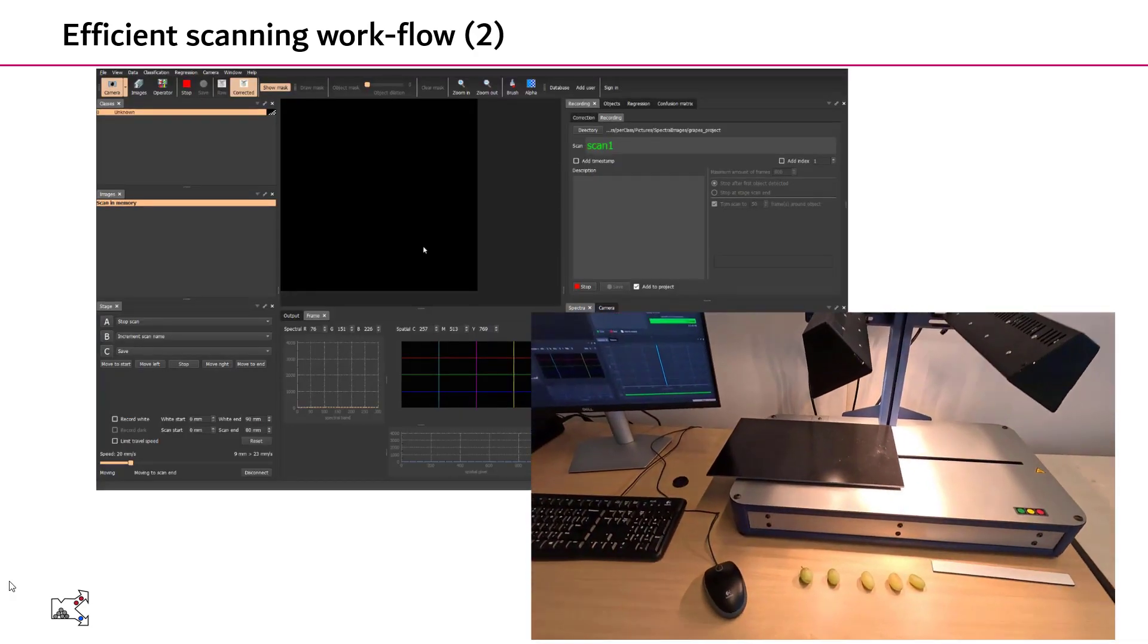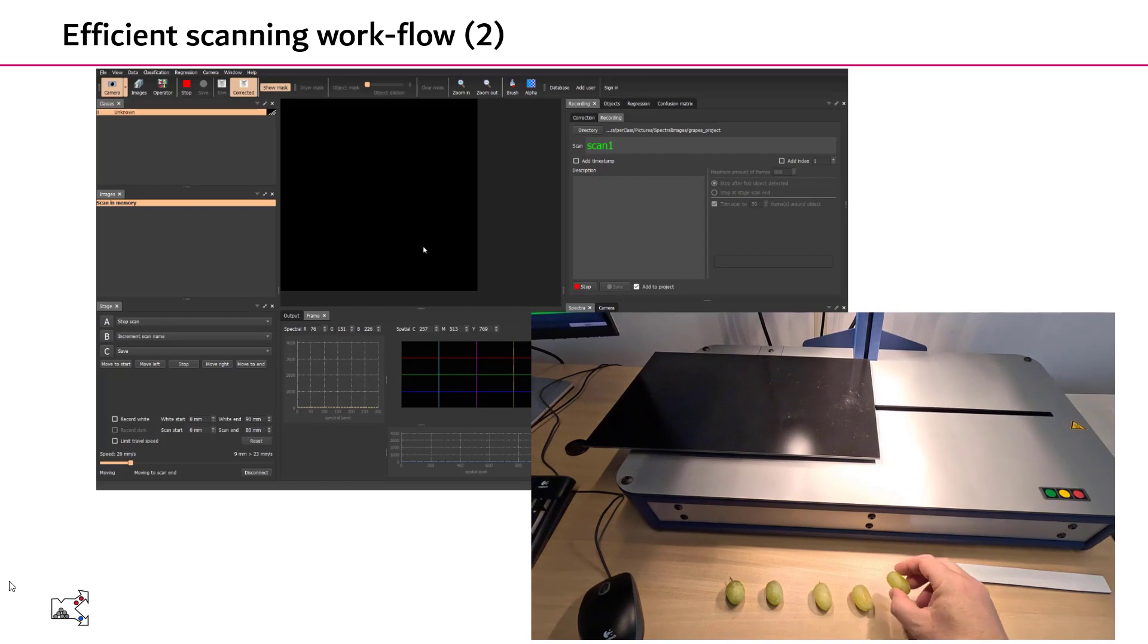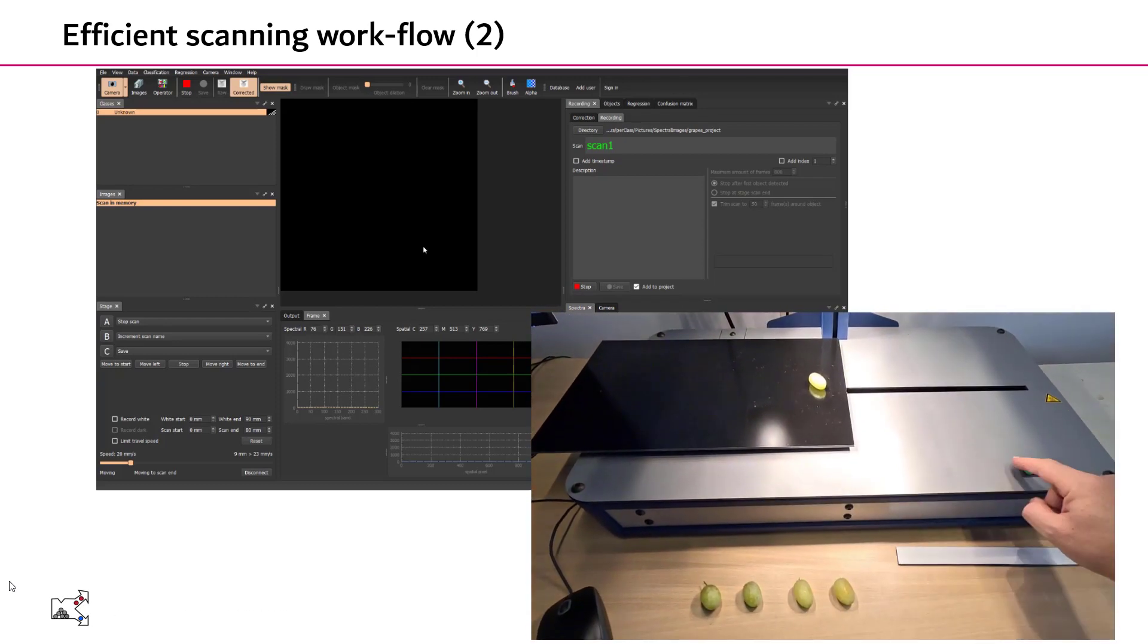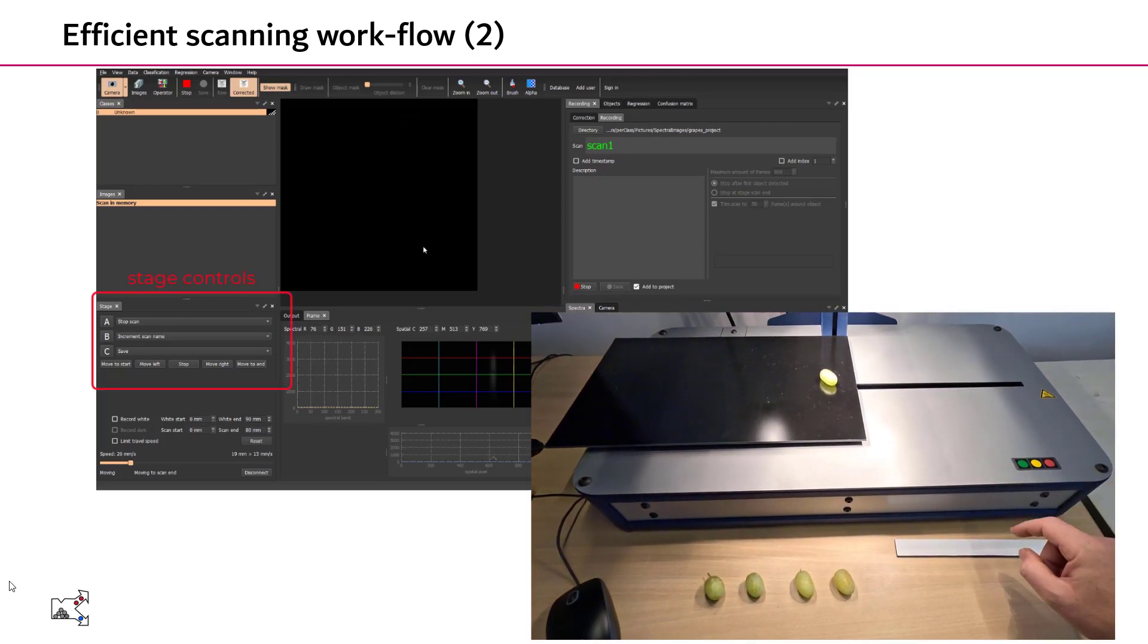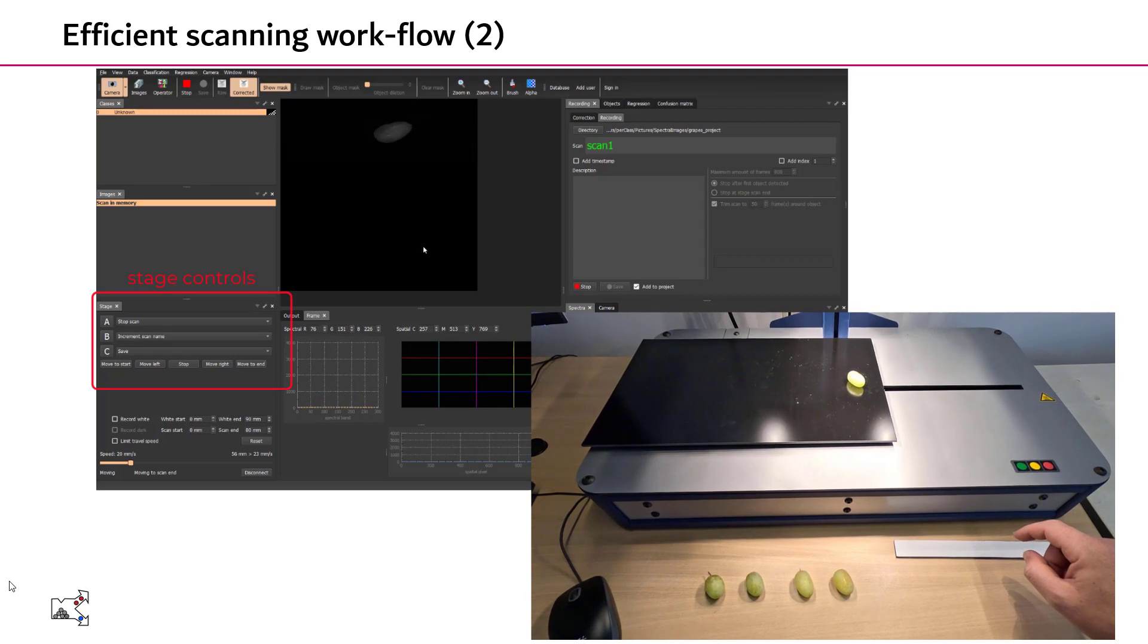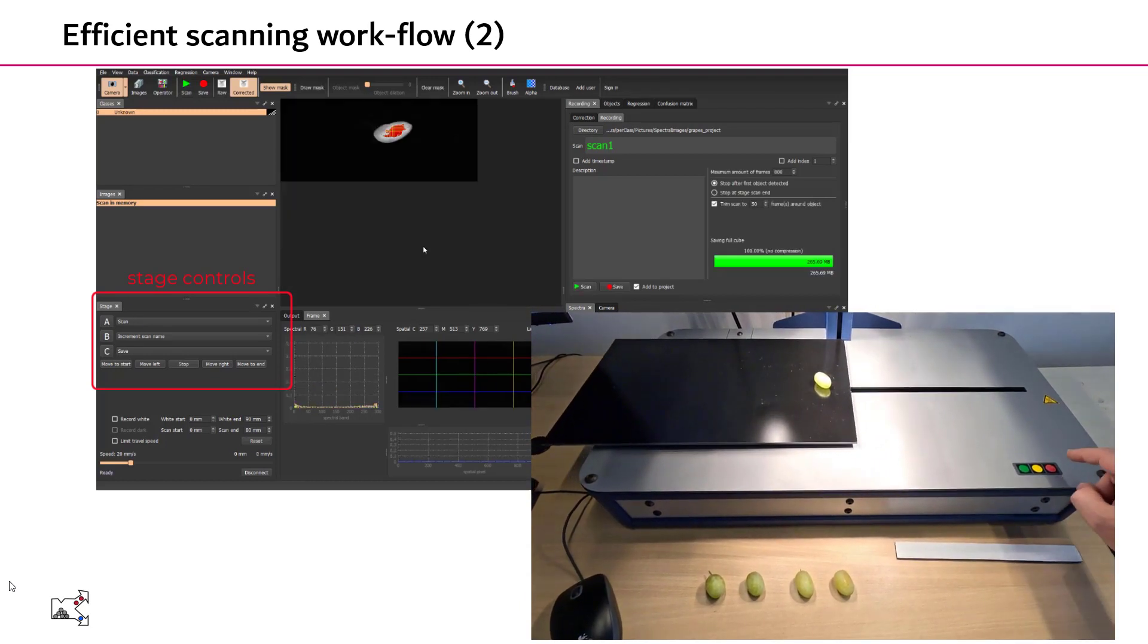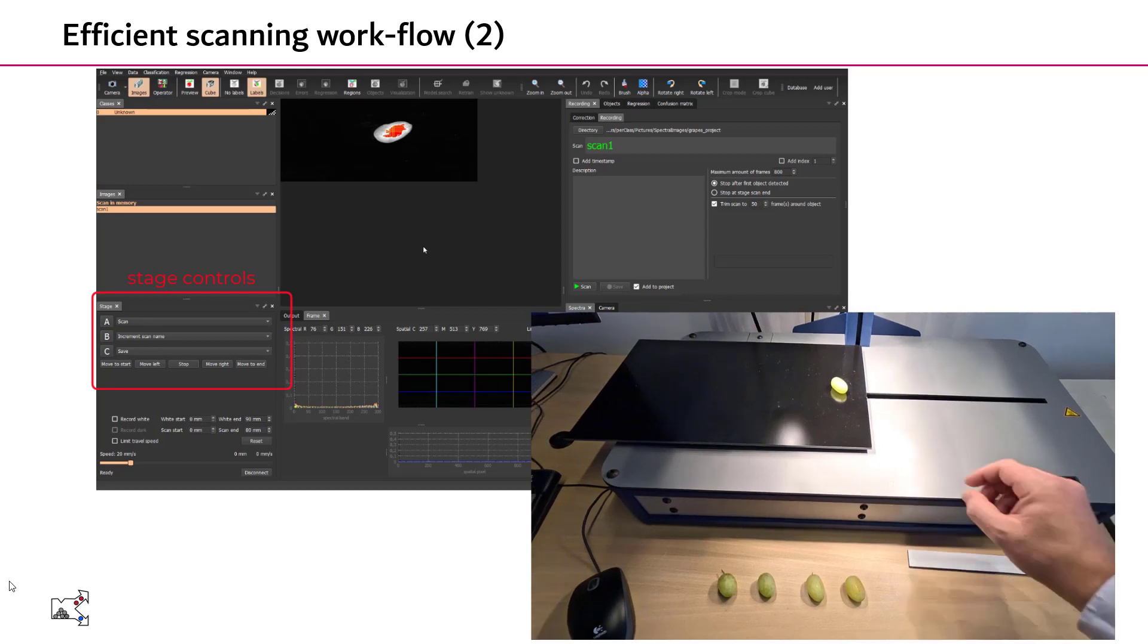Here we have our system. We take an object, we put it on the table, and we press the green button to scan. Once the scan is ready, we decide to save it by pressing the red button.